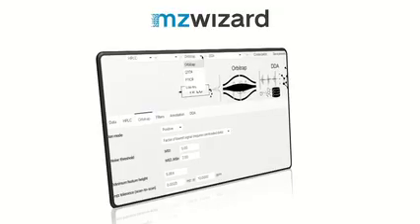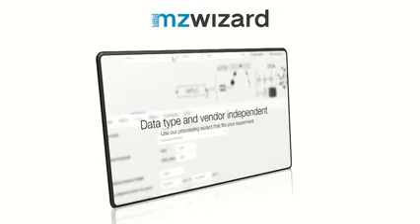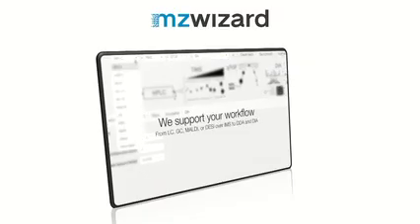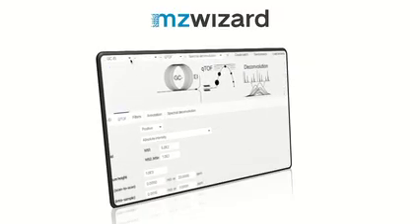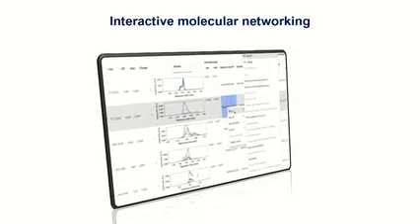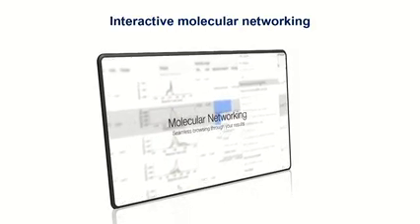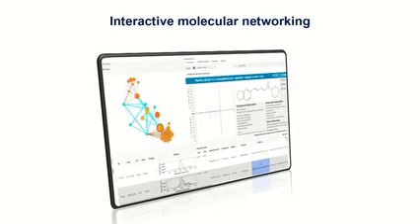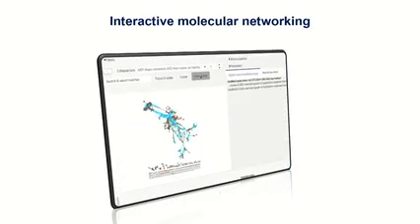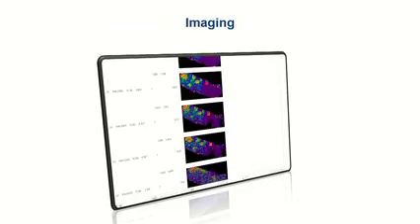MZmine. So we have the MZwizard, where you can quickly set up workflows depending on the type of the instrument and the type of analysis that you're doing. And you can quickly create batch files that process all your data. We have interactive molecular networking, where you can give context to your data sets. You can look for your molecules. You can overlay the annotations over your molecular networks, and you can find related molecules.